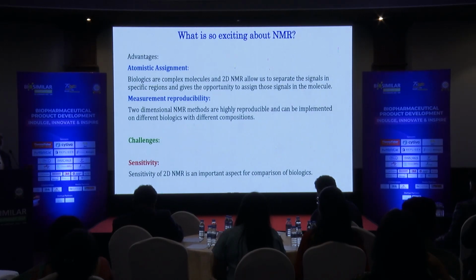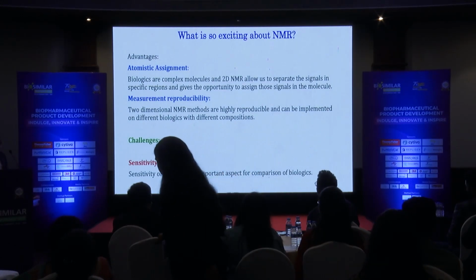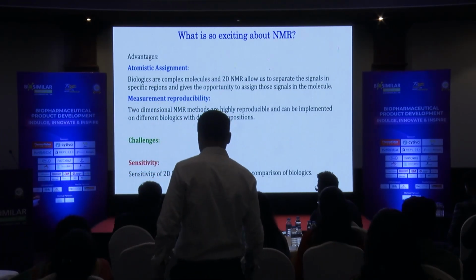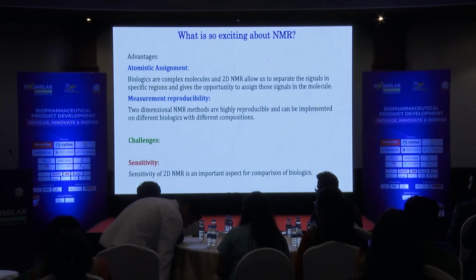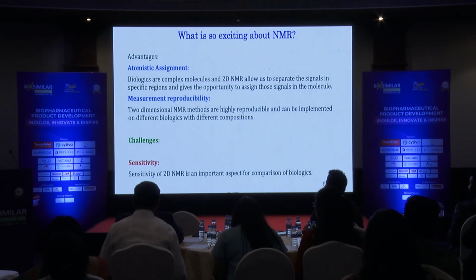So every time you record the spectrum, if you are not changing any physiochemical property, you get a highly reproducible spectrum, and that again gives you the advantage to show the similarity in a more detailed way. The only challenge with NMR is its sensitivity. It's one of the insensitive techniques, therefore you require a lot more sample than the usual other biological techniques.